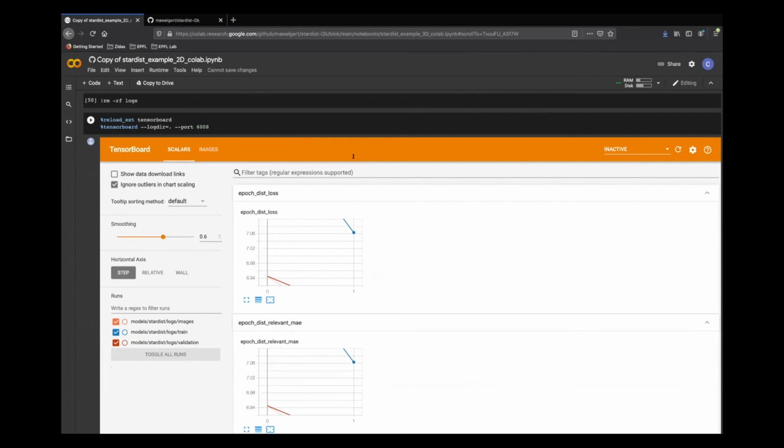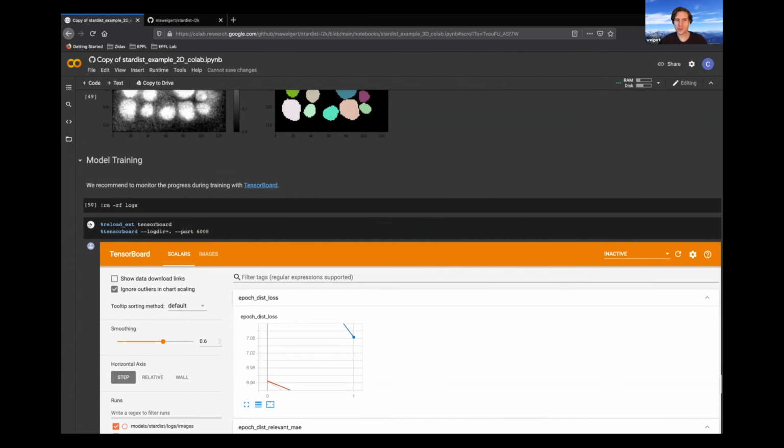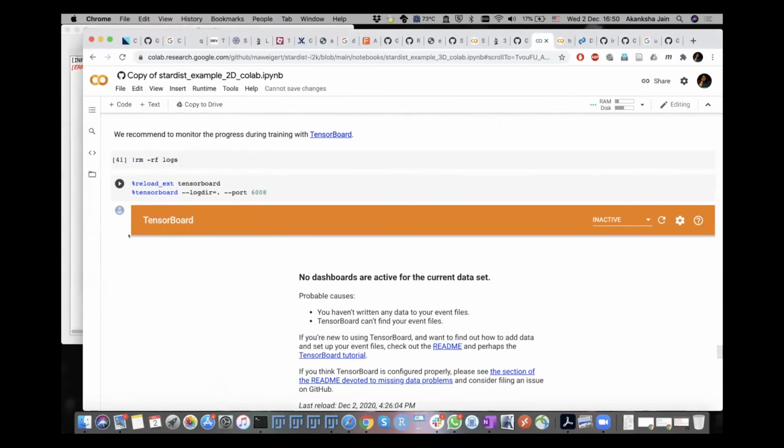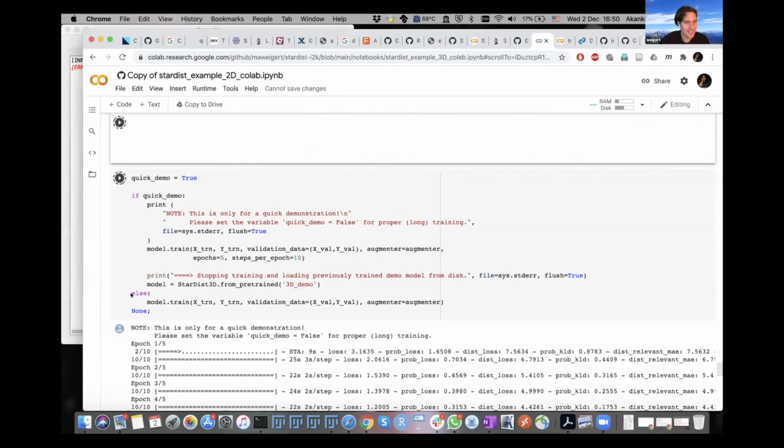Martin? Yes. Sorry, can you explain again how you went to this these graphs? I missed that. Did you, so you run that code cell? Yeah. The extension reloading? Okay, sure. So, or just share your screen. Yeah, share your screen. No, sorry, I got muted. Okay, I share my screen. Yeah. So I am here. Mm-hmm. I have to run yeah, this. That's Don't rerun it. Oh. Ah, shit! Sorry, I'm so sorry. I didn't hear you in time. No, it might still, yeah, it might still work. So the training is going on.